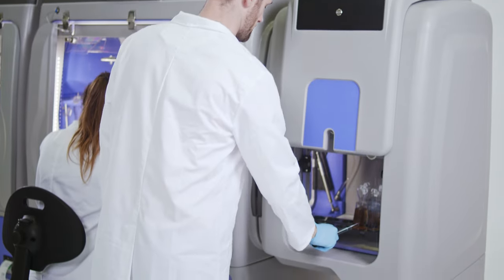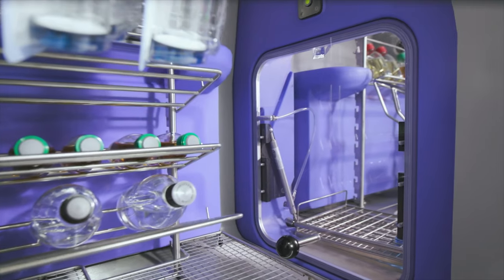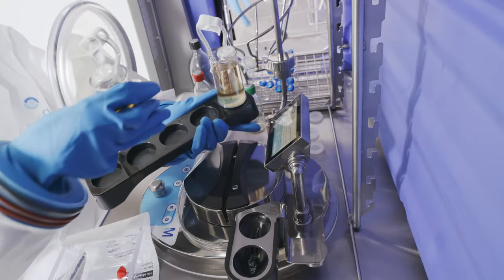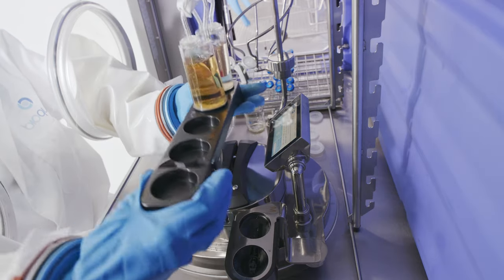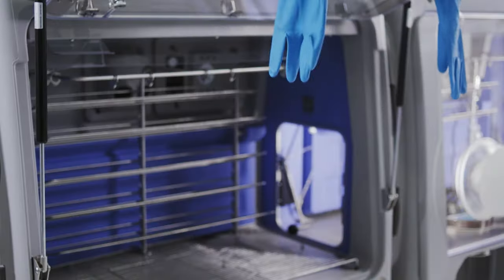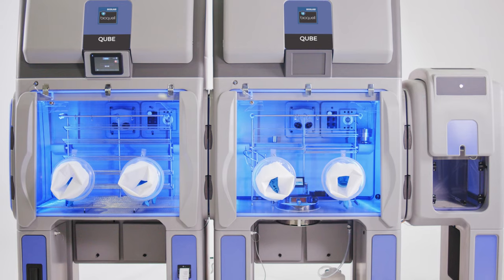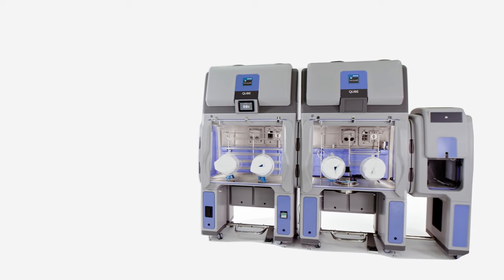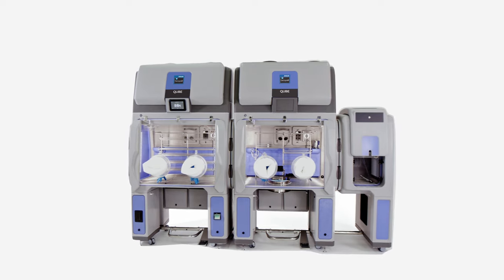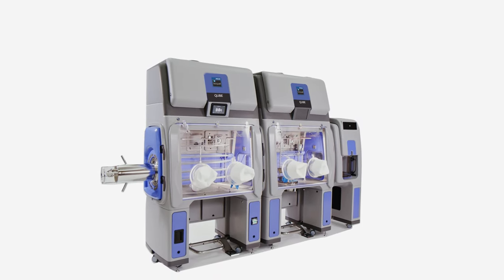A comprehensive solution utilizing hydrogen peroxide vapor decontamination with industry-leading technology and ergonomic design, the BioQuell Cube provides an ideal alternative to traditional stainless steel isolators. Whether you work in sterility testing, drug compounding, or gene and cell therapy, the BioQuell Cube is an efficient, reliable, and easy to implement system for the biopharmaceutical laboratory research and biotechnology industries.